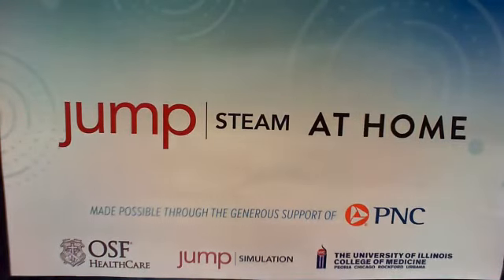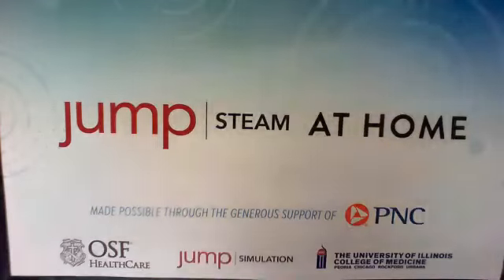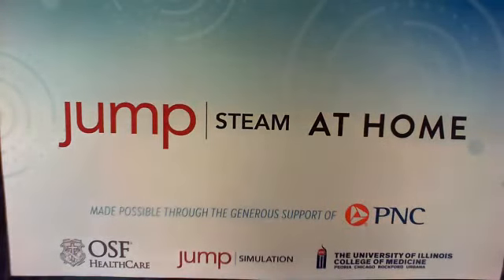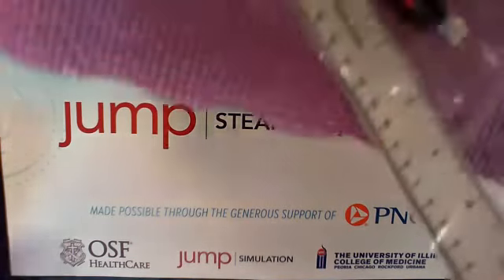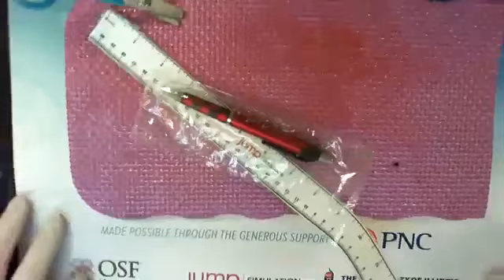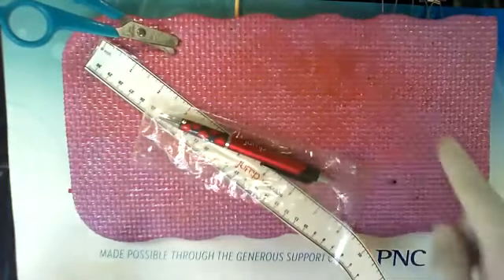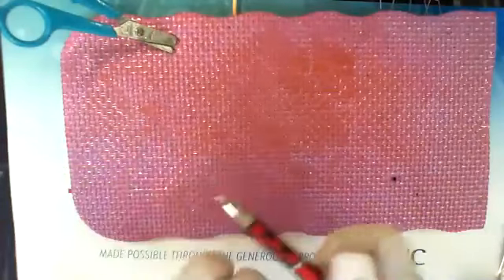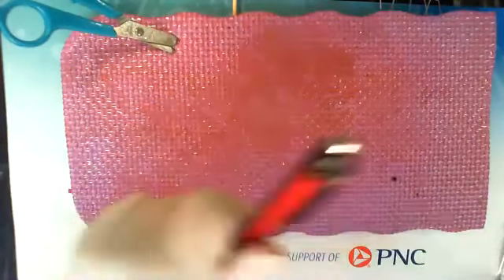Next thing I'm going to do is I'm going to put my pad down. Actually, I'm going to put gloves back on. Pad's back, right here. And then it still has my pins across the top. I'm gonna slide this down. My pins across the top, my probe, my scissors, my ruler. I'll sit over here to the edge. My pen for writing. You're gonna throw this away when you're done too.